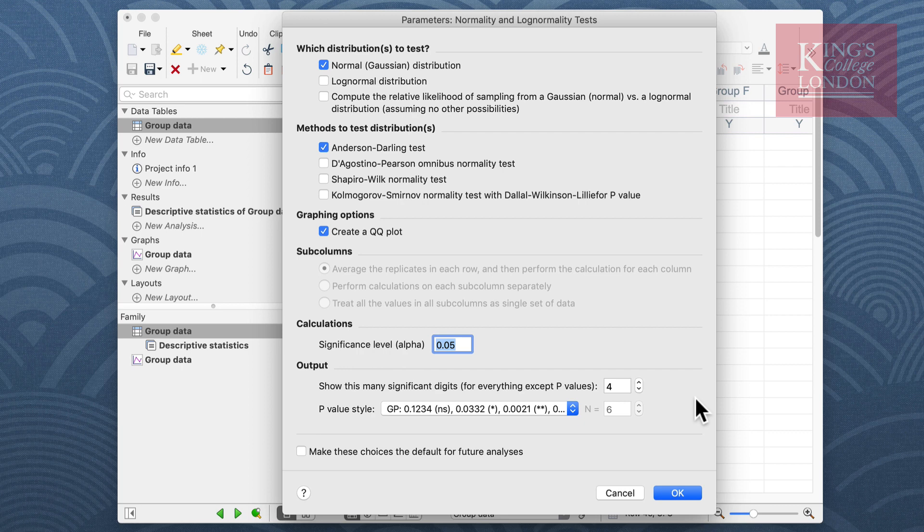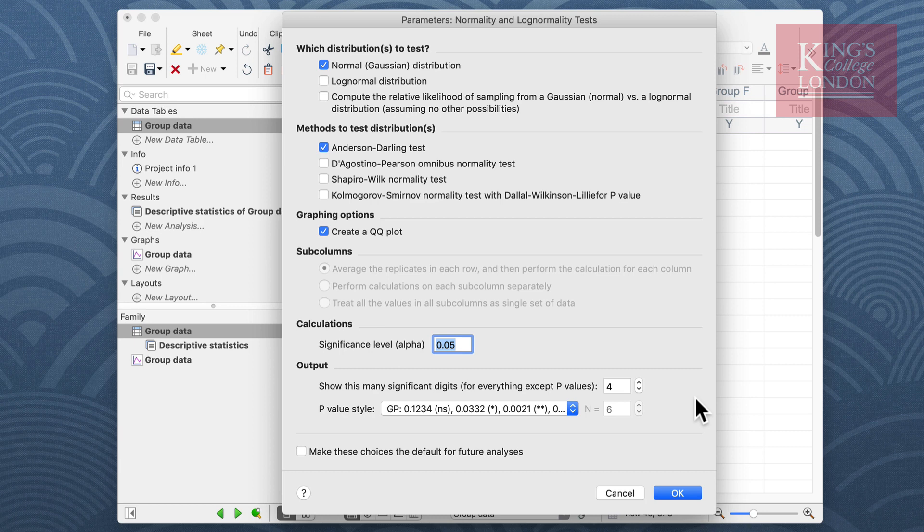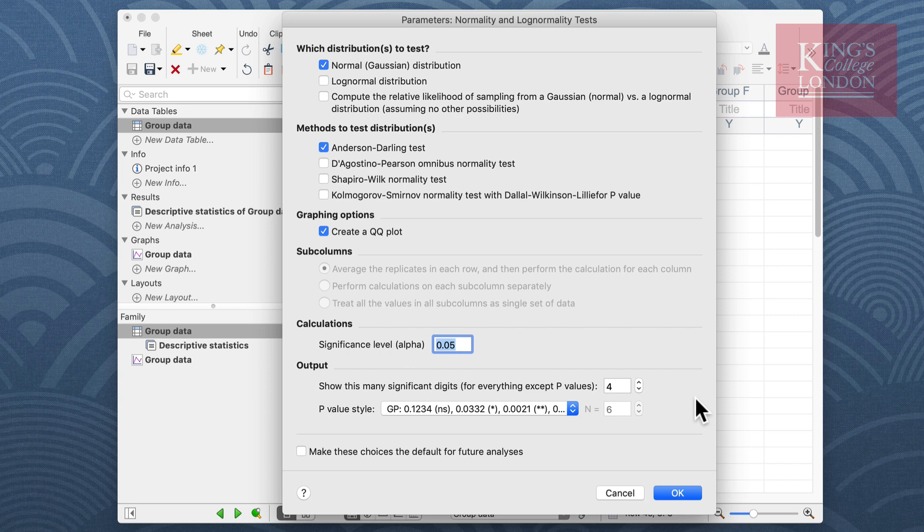The next window is the parameters window in order to carry out normality tests. In this example I'm going to carry out a normal or Gaussian bell-shaped curve distribution test, but I could also choose a lognormal distribution. There are a number of options in Prism of which method you wish to test your distributions.